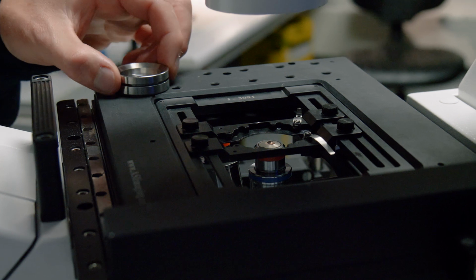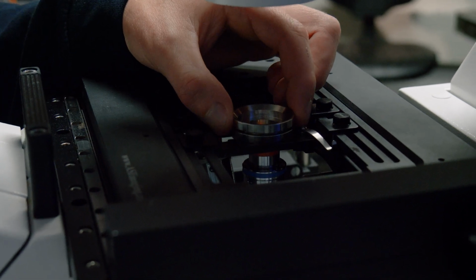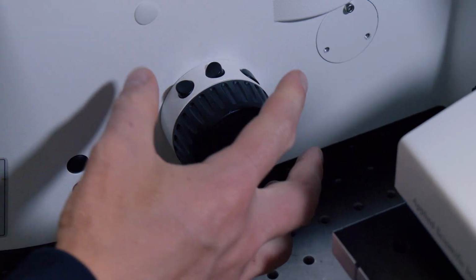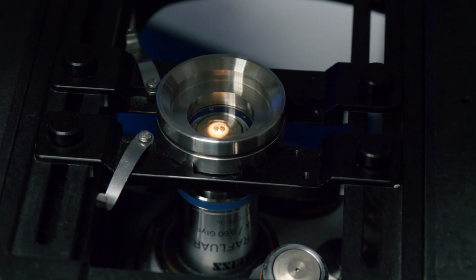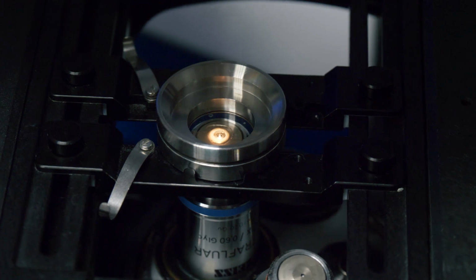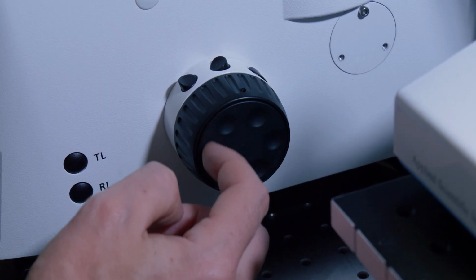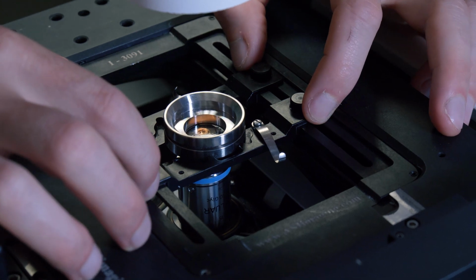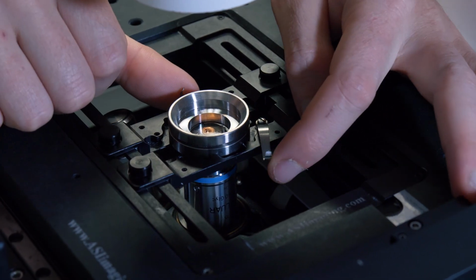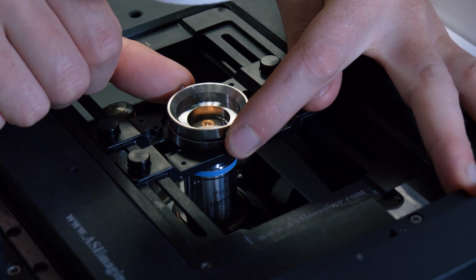Load the sample onto the stage and adjust the stage to hold the sample without blocking it. Move the objective upwards using the coarse focus knob until the glycerine droplet starts to spread onto the cover slip. Continue to adjust the objective using the fine focus knob. If needed, secure the position of the sample by adjusting its position on the stage and using stage clips.